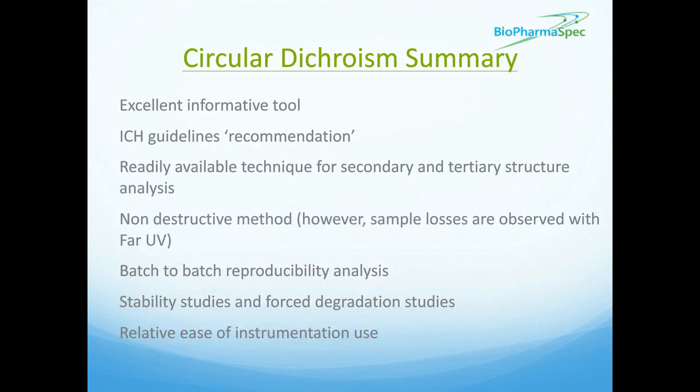So, in summary, CD is an excellent informative tool. It's actually named in the ICH guidelines, so again, it's almost like a must-do. It's a relatively readily available technique for both secondary and tertiary analysis. It's a non-destructive method, so you can take the sample out of the cuvette and use it for something else. So again, that's very useful.